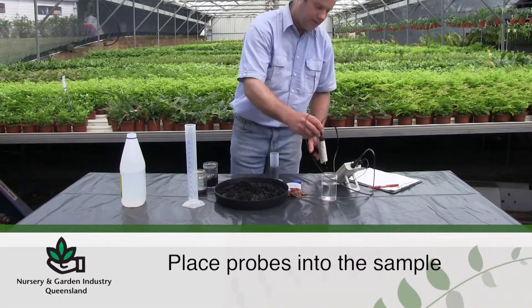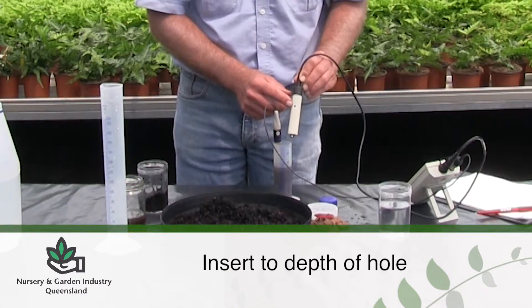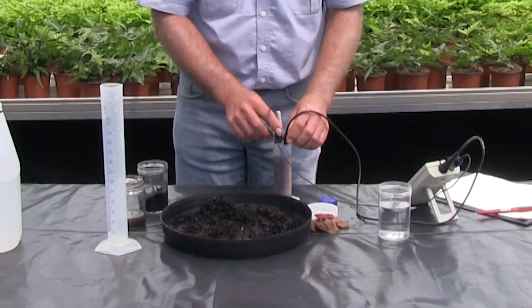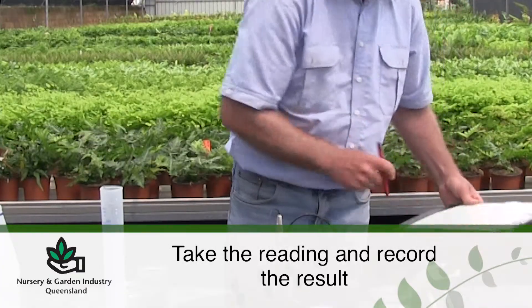Insert the pH and EC probes into the strained sample, ensuring the EC probe is inserted to the hole to get an accurate reading. Turn the meter on and wait for the reading to stabilise before taking the reading and recording the result.